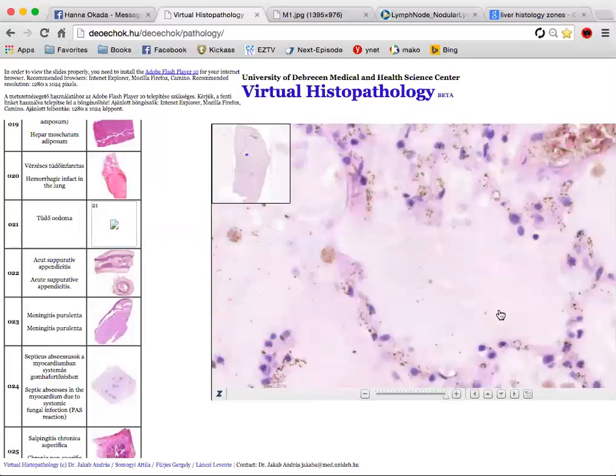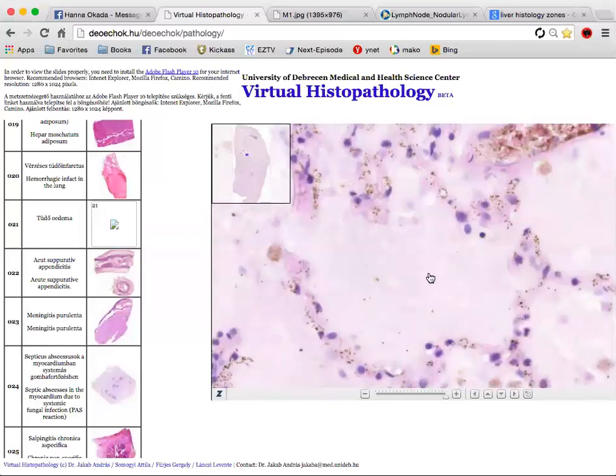In the autopsy class, we saw fluid with pus, I think. No, this will not have pus. You might have seen pneumonia. Edema is the liquid induced by transudate, right? So almost no proteins here.